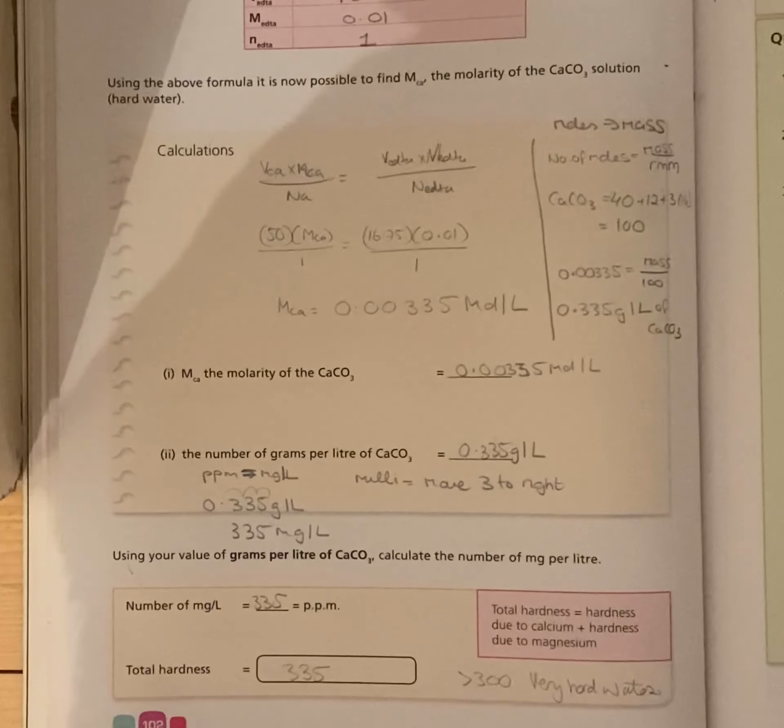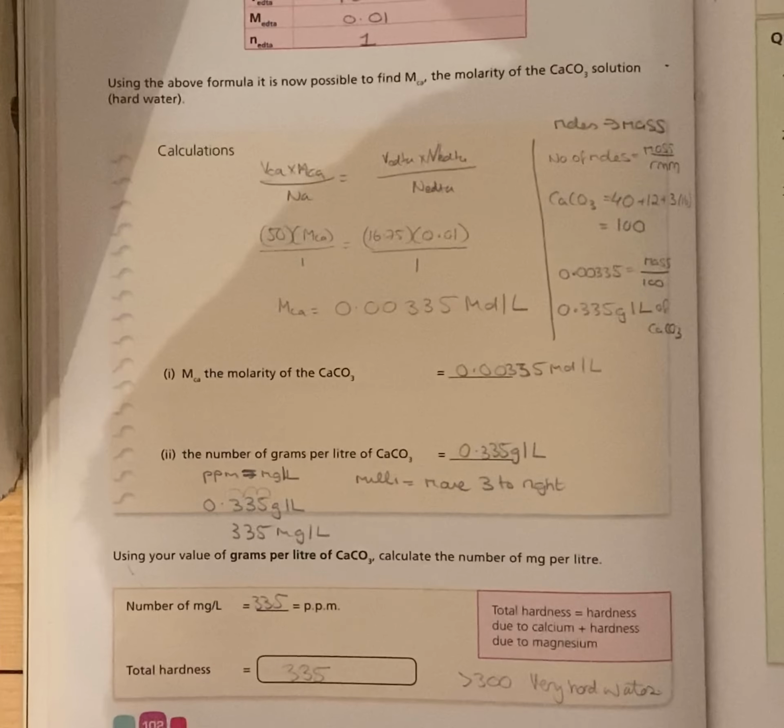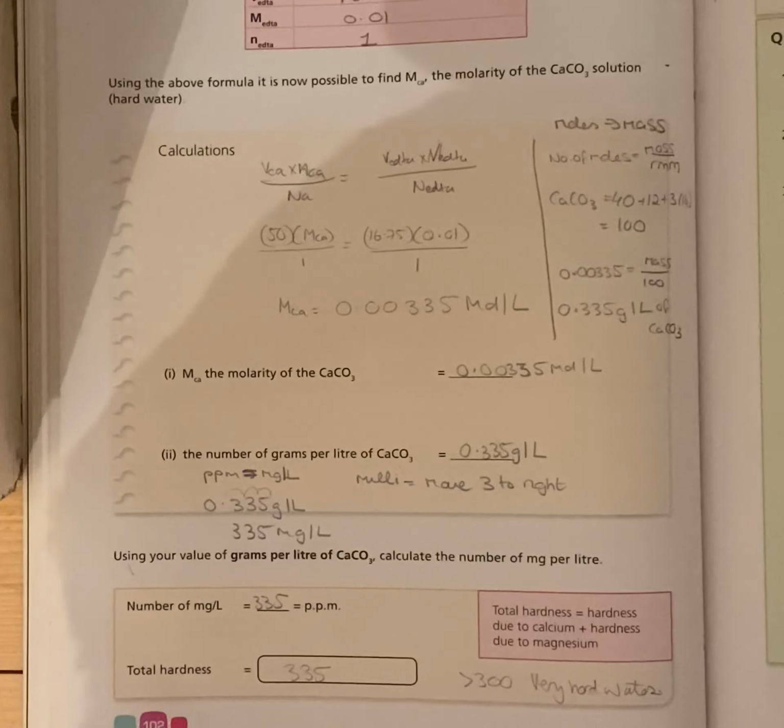If you look in your book, there's a scale for what level of hardness links with what parts per million of the ions. And if it's greater than 300, it is very hard water. So my sample is very hard, and that can be your observation or conclusion as well.